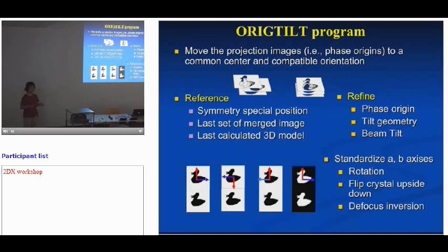So there are flags inside the program that allow you to do this sort of conversion. And there are other cases as well. I try to describe a few of these here. And the other one that's common is that you put a crystal down there, and unless you have a two-fold or two-sub-one axis in the plane of the crystal, when you flip it upside down, you don't get the same structure once you start tilting.